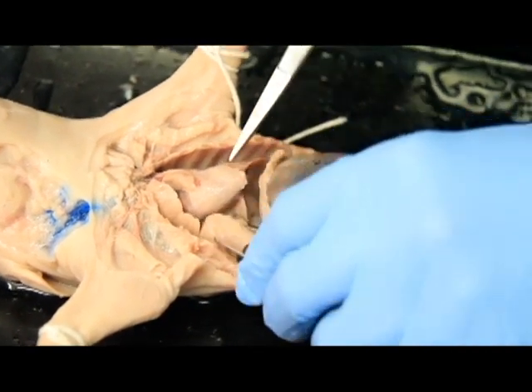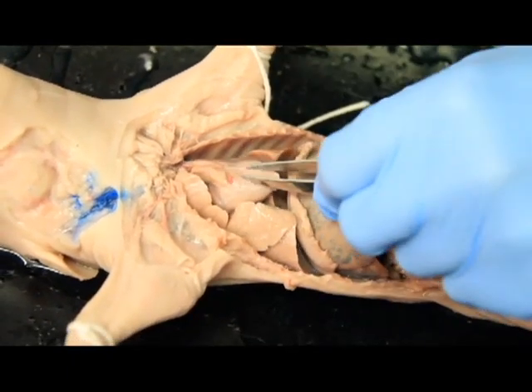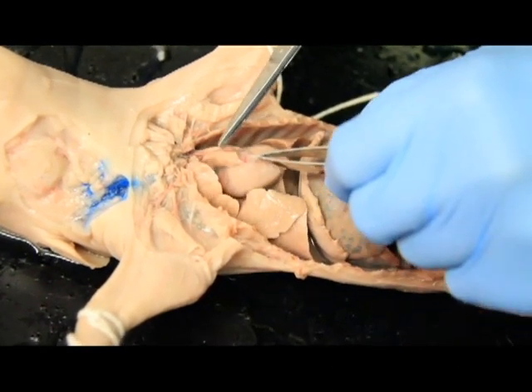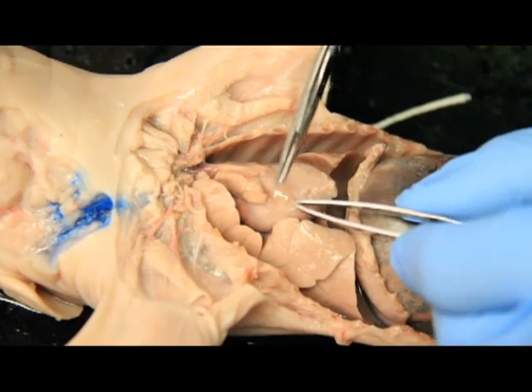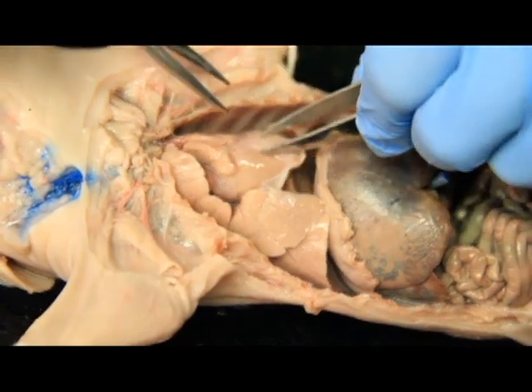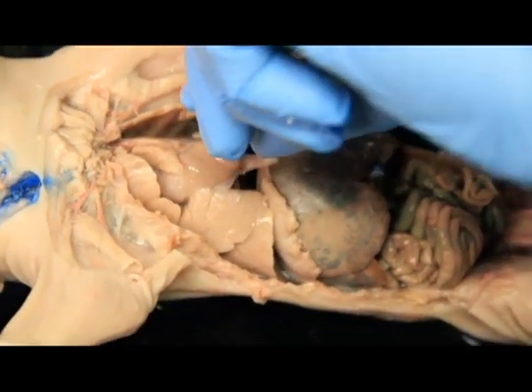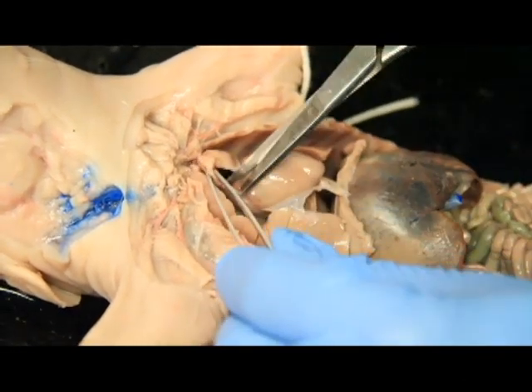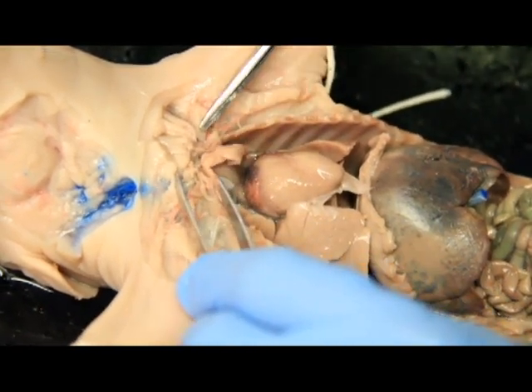Now going into our chest cavity, again you see the lungs here on either side. All of these lobes are lungs. You can see this very thin material, so flaps here. These are all lungs. And again, this membrane that surrounds our heart is our pericardium. And above the pericardium, on top of the heart, is this thymus. This area right here is all thymus. So what we're going to do is cut this pericardium away, but leave the thymus there. We're going to cut it just enough so that we can flap it back, but not get rid of it. So we're going to cut right through here, and that's to expose everything underneath that pericardium, including many of the parts of the heart. So now we're going to take this thymus and flap it up a little bit.